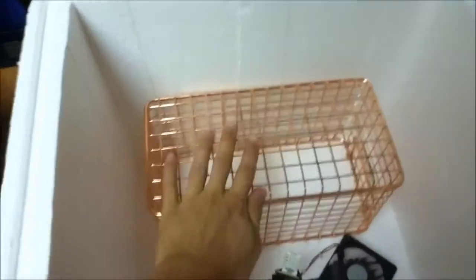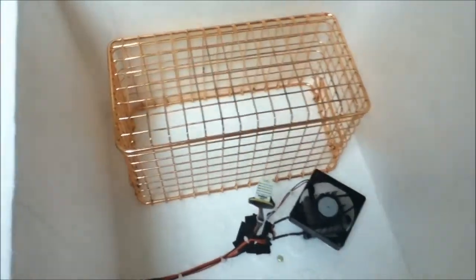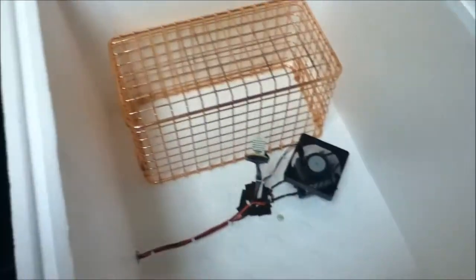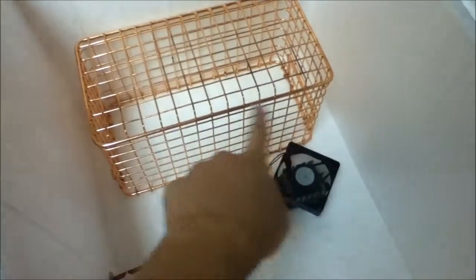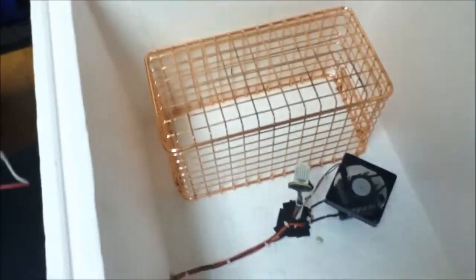Those are just copper baskets that I used as racks. That came in pretty handy too, because copper is antimicrobial. For humidity, I just put dishes of water underneath those racks, and that kept it around between 90 and 100% humidity pretty well.